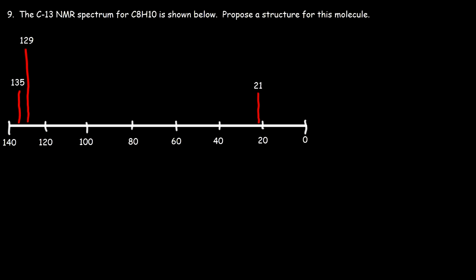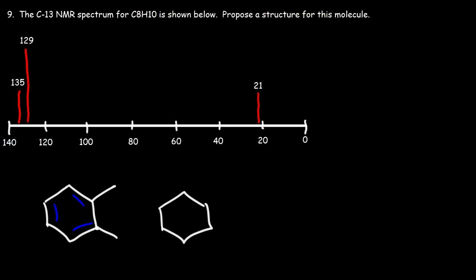When in doubt, the best structure to draw when having an IHD of 4 or more is the benzene ring, because this is going to be the most common structure that you're probably likely to encounter. Besides that, if it's something else, you'll need other forms of spectroscopy to basically pinpoint what it might be. So here we have a total of 8 carbons. This is orthoxylene. Here's another possibility. We could have ethylbenzene. So this has an IHD of 4 with 8 carbons.